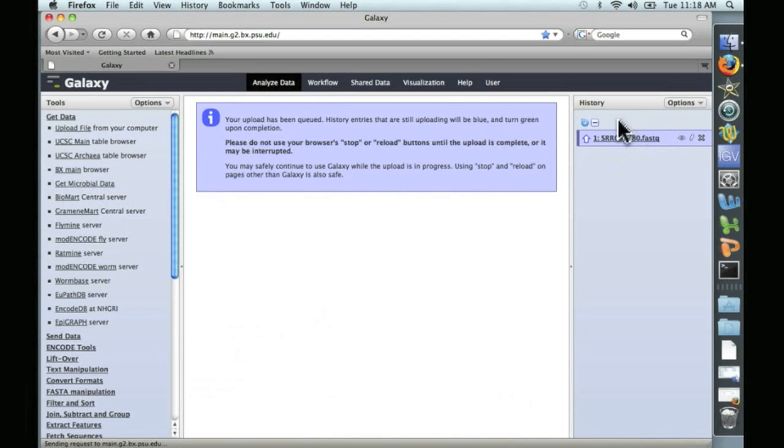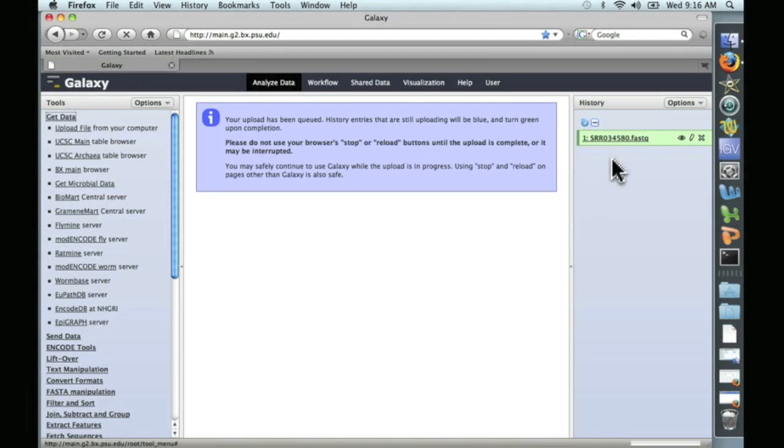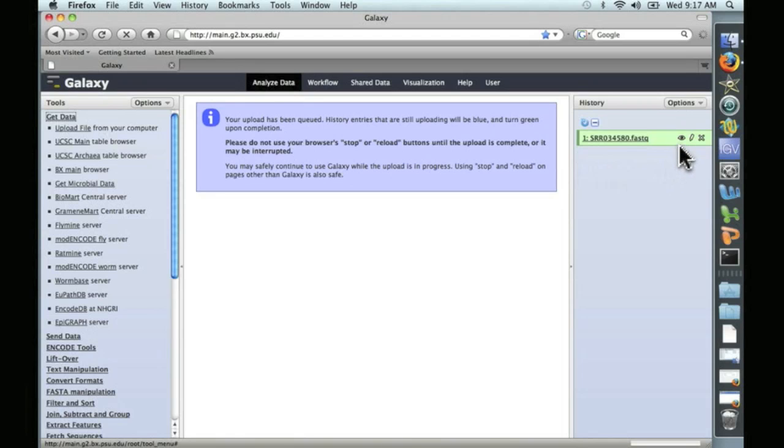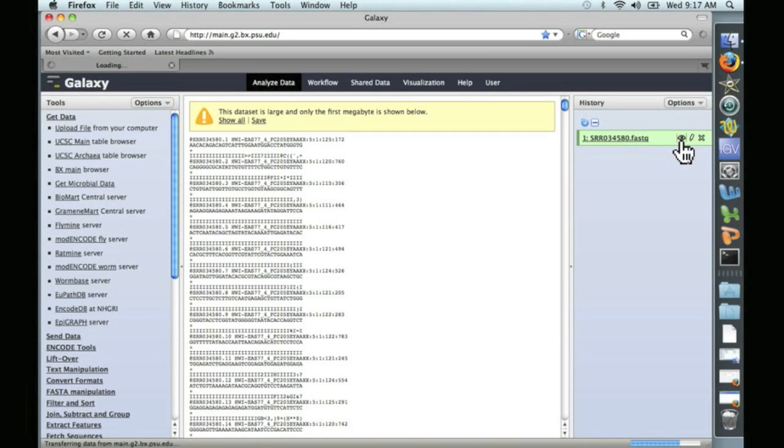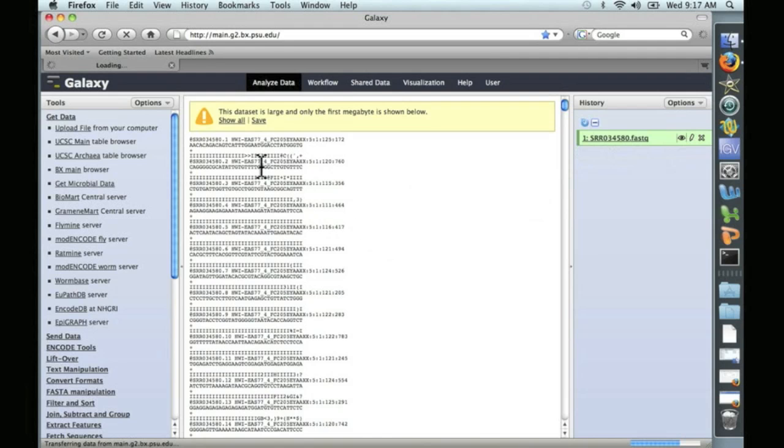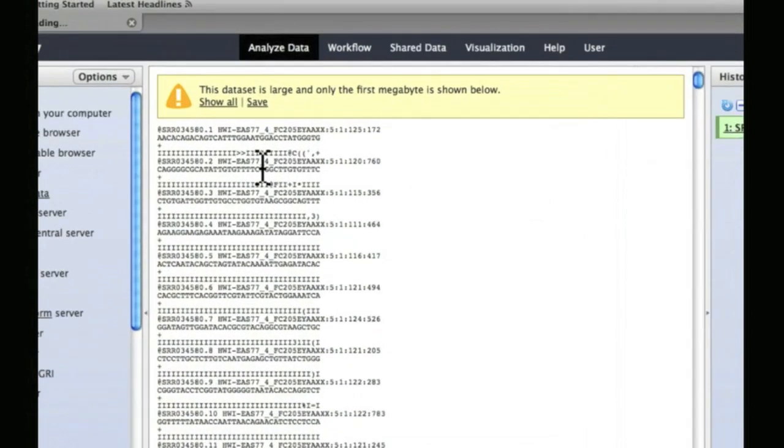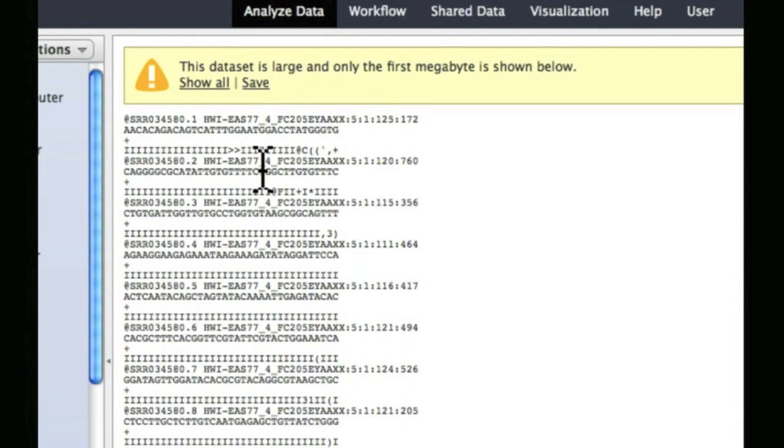You can see here that it's blue. That means it's in process. When it's finished, it will turn green. And now we're green. Over my slow DSL connection, that took a few hours to upload. Let's go ahead and take a look at it. The eye icon right here allows you to view the file. Not all of the file, but the first megabyte of the file. And as you can see, it looks the same as it did in the terminal. So far, so good.